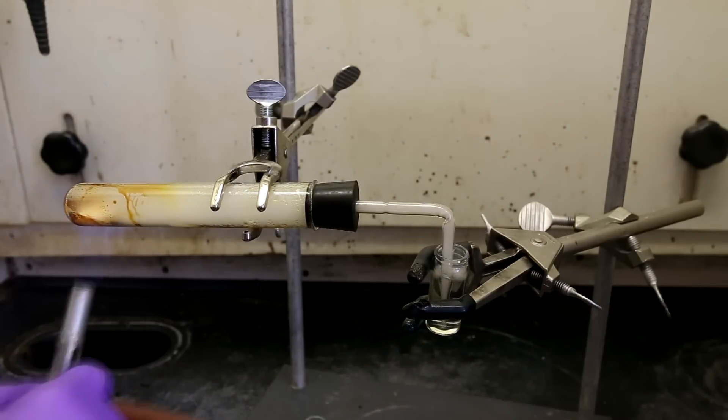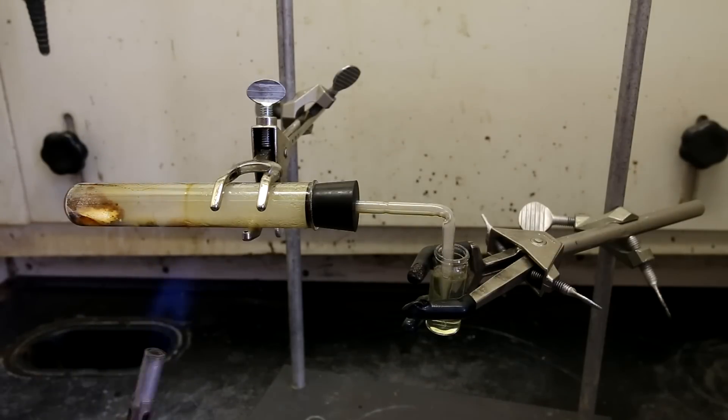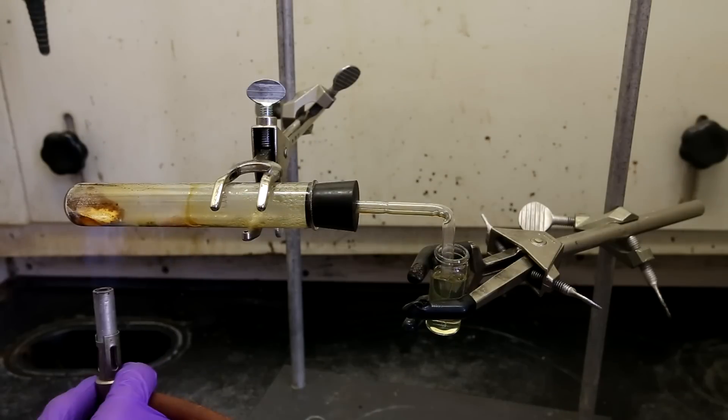As I heat up the test tube, you will see a lot of brown-yellow liquid condensing on the walls. This is the cadaverine that is vaporizing and then recondensing.